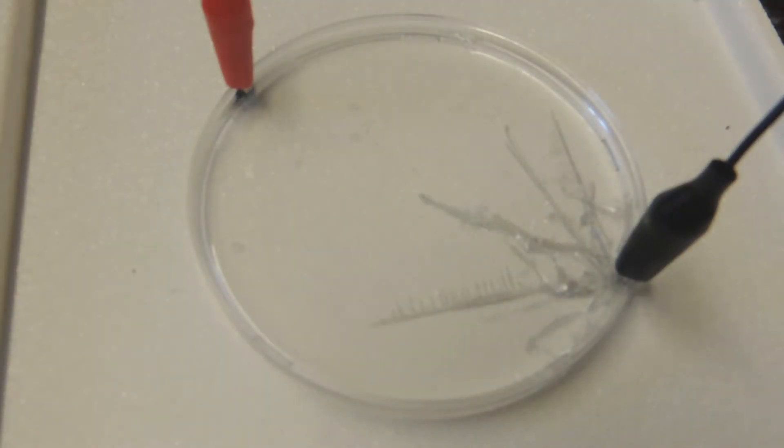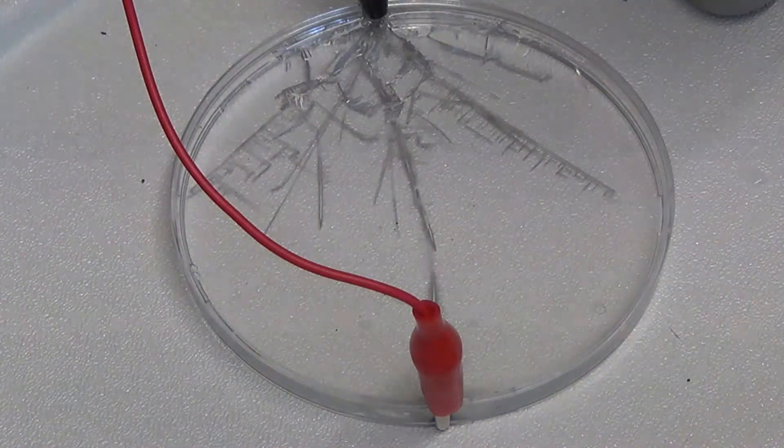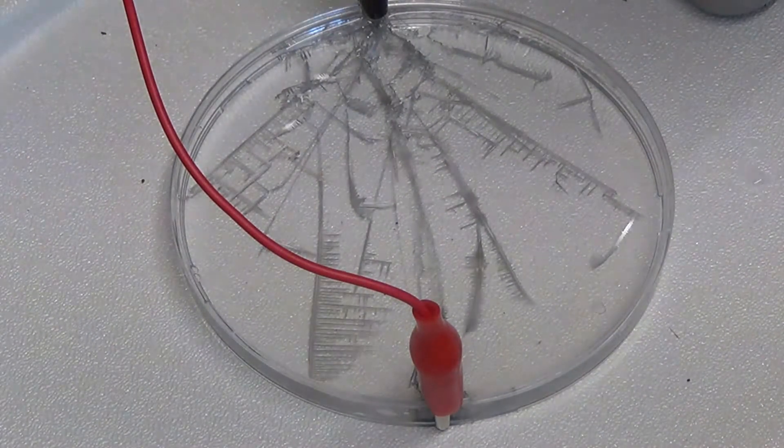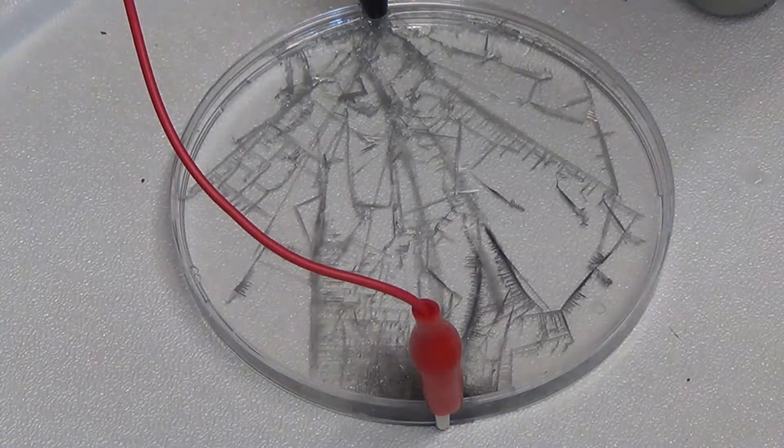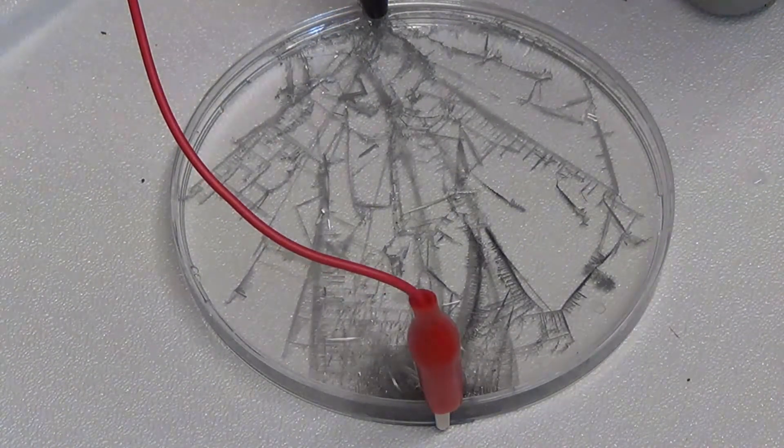Here's a time lapse of the experiment. You can see from the negative terminal, tin spikes are starting to form and they go all the way across to the positive terminal. But not just in the most direct route — they sort of fork out in all directions.